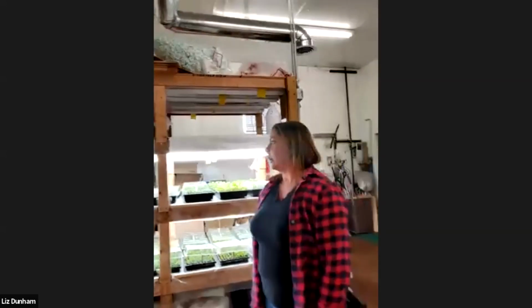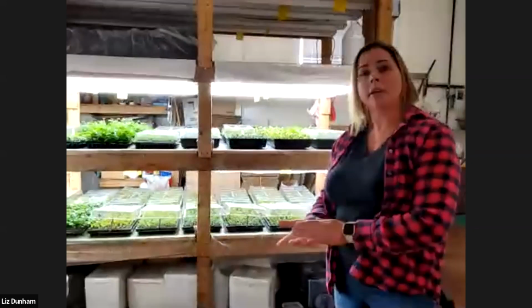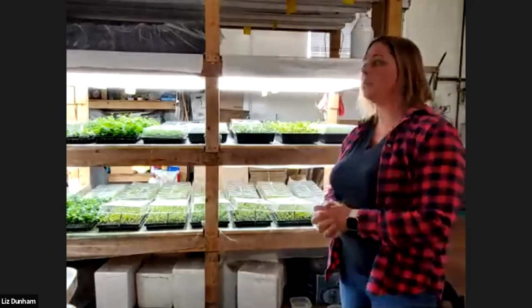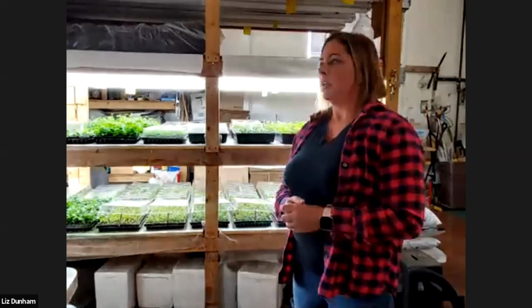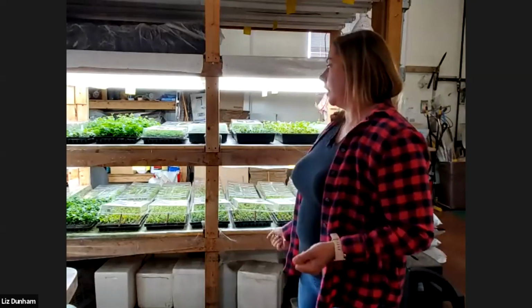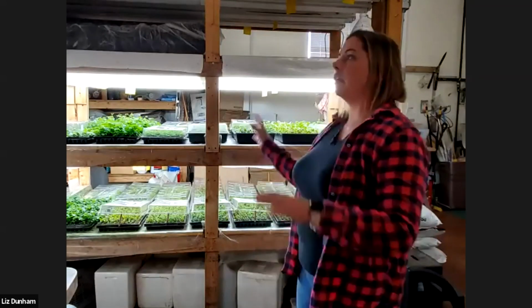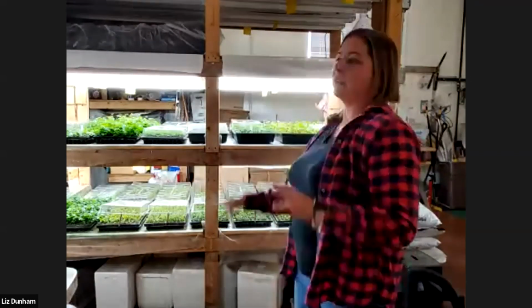So this is the planting room. We're one of the few labs that does rooting on our plants. This is the #1 way that we sell our plants. There's a lot of customers that can't take things directly out of culture, so we put roots on them. And we have an indoor growing space in order to do that. We have 3 benches with 7 levels. All the lights can be run separately.